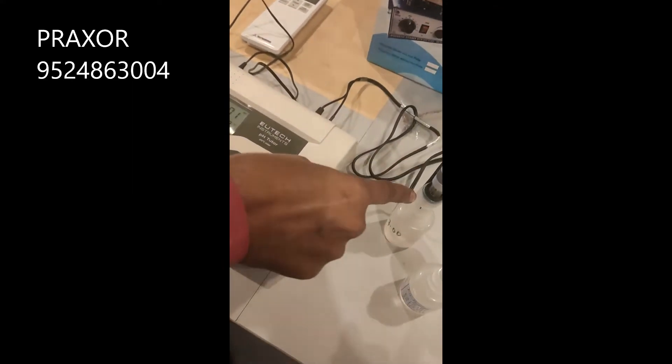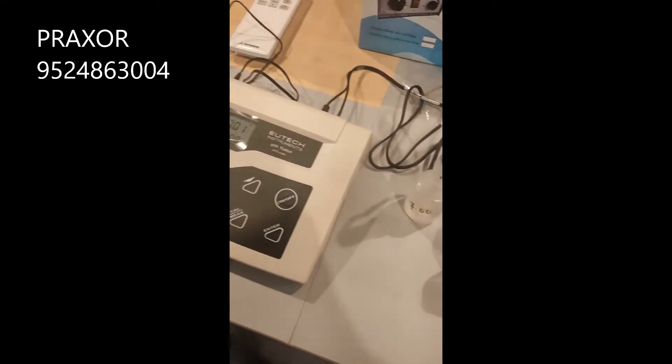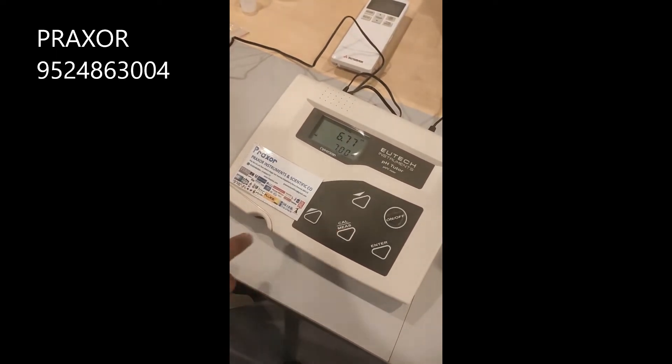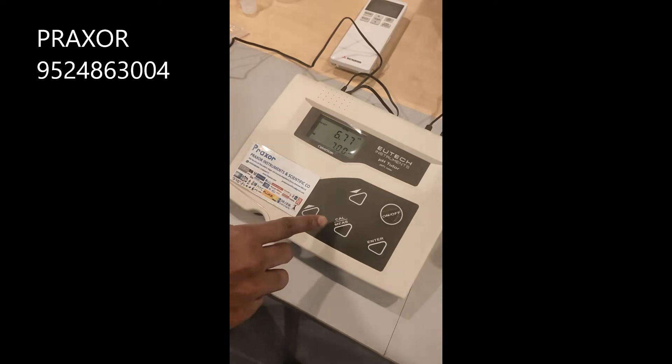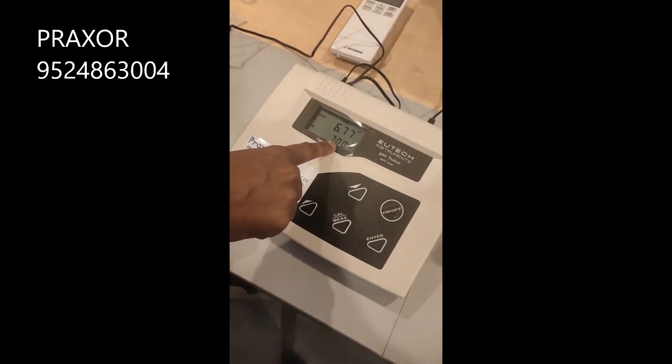Dip the pH electrode in the pH calibration 7 solution and long press the CAL key. Once you press the CAL key, the lower display will show the 7 pH value.